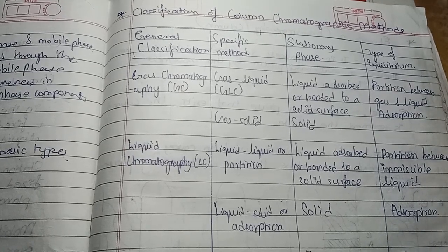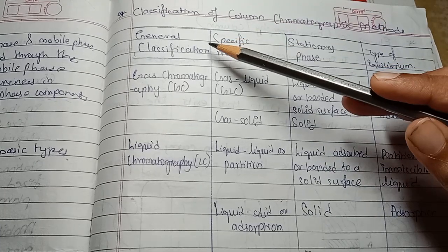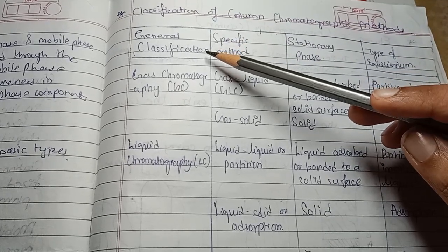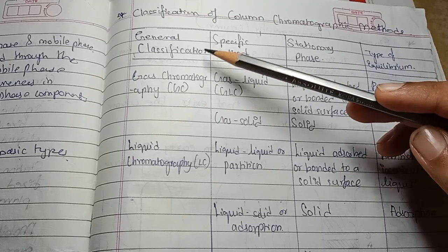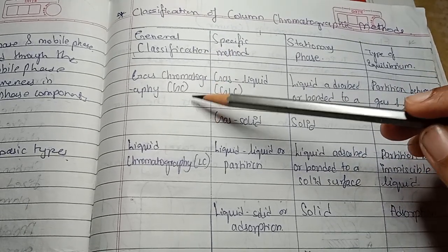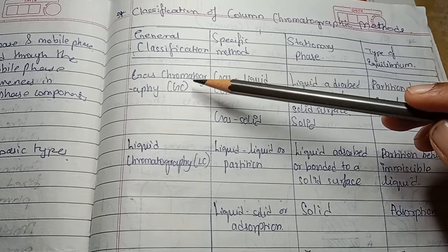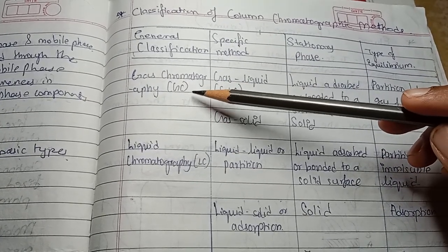Hello friends, today we are going to learn about the classification of column chromatography methods. Here we are going to learn the column chromatography methods. A number of different kinds of column chromatography are there. The chromatography differs as per the specific method, stationary phase, and type of equilibrium, and their function also differs.